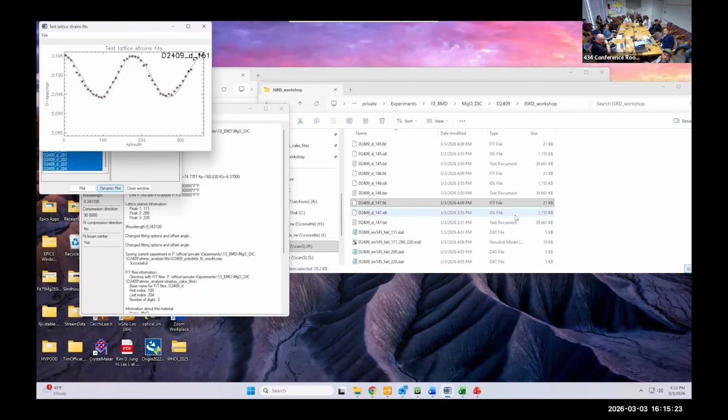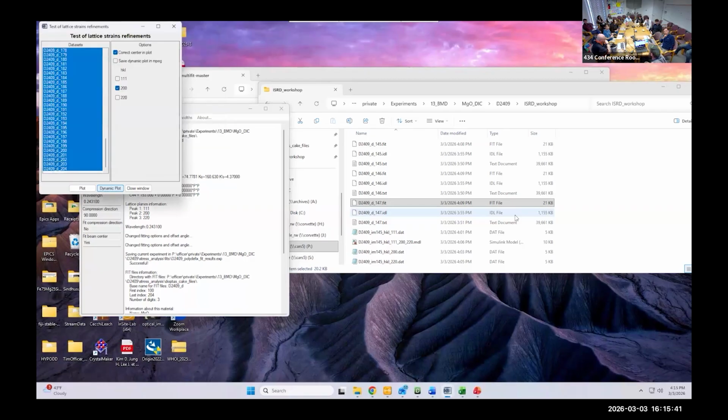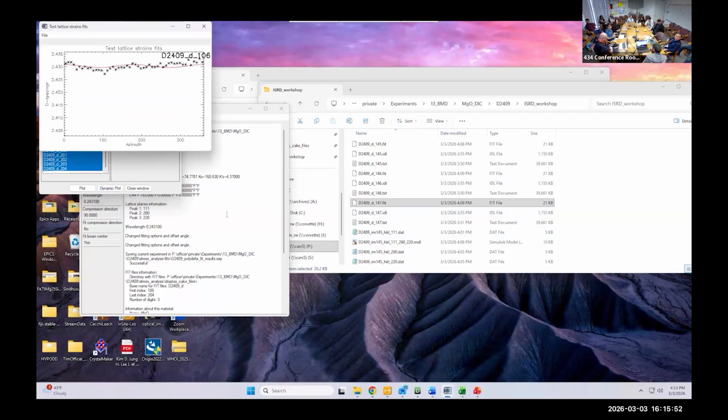And we're building up stress, and that's what it looks like. You want to plot the stress? Oh, it's still going. I think there are about 100 images in here. This one was worse data though. Let's just look at how it is. Stress is high.